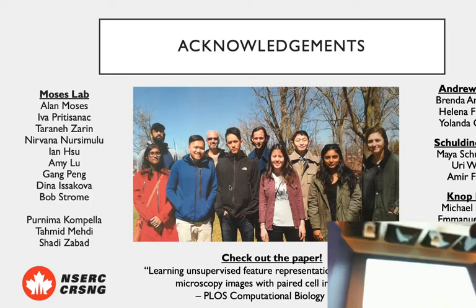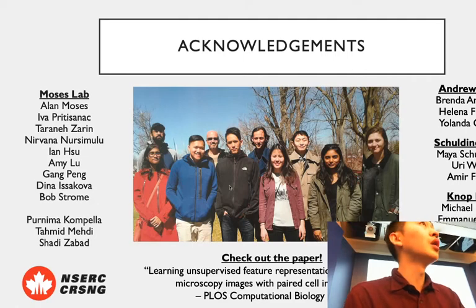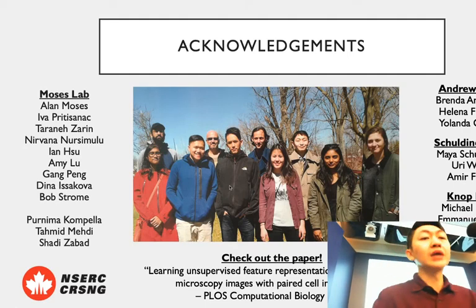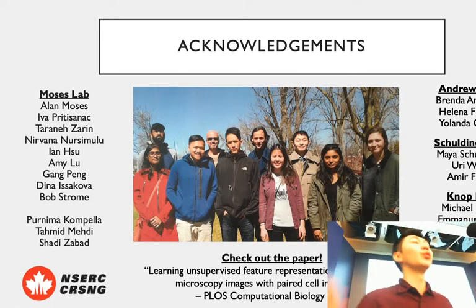Do they make errors in the same areas? You mean the confusion matrices? Okay, that's a good question. We did not check that specifically. I think one of the reasons why is that although we did build a classifier, we were actually not really interested in building the best possible performing classifier. It was really just to prove what we could do with the classification, right?